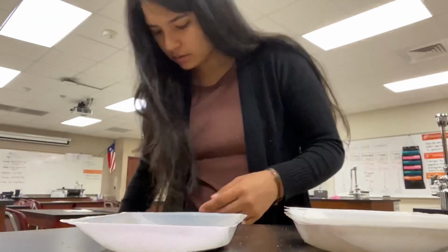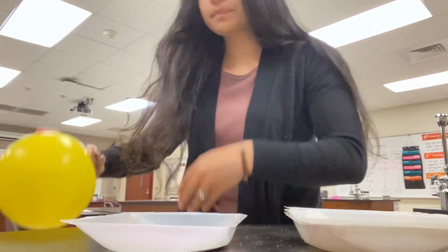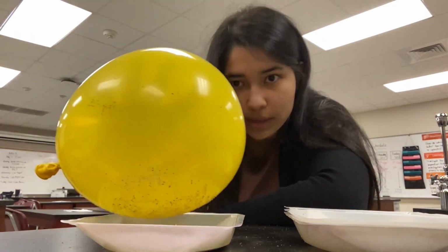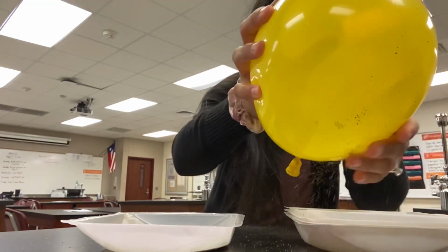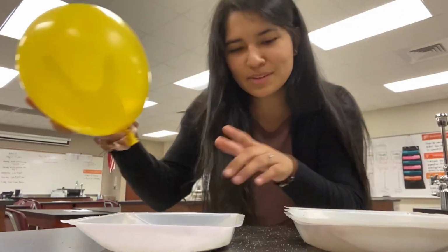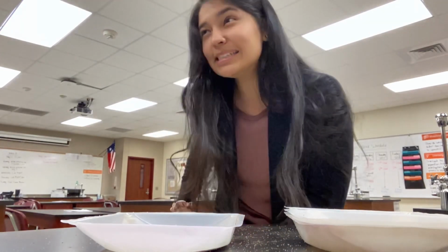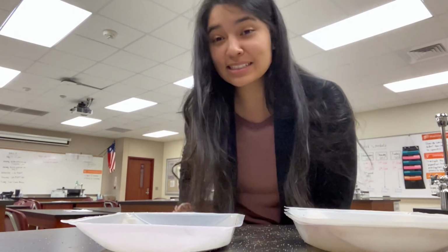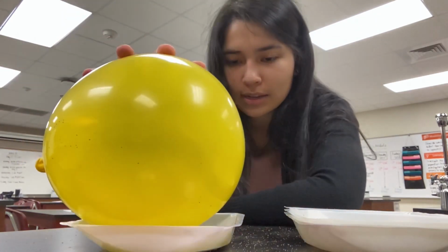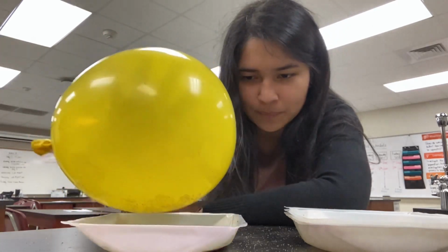We would do that over time, and ideally you would take out all the pepper. So we continue doing that over and over. I'm missing some of it, and some is falling on the table. Ideally, what you want to do is collect as much of your sample as possible, so you don't lose any amount of it. Because of the law of conservation, you want to make sure that your percent yield is pretty high.